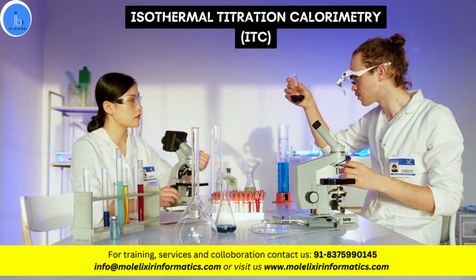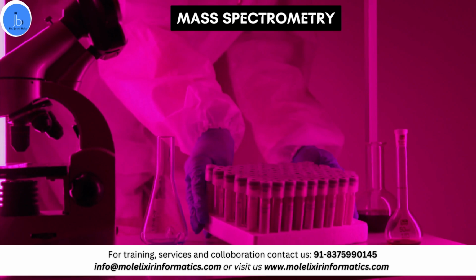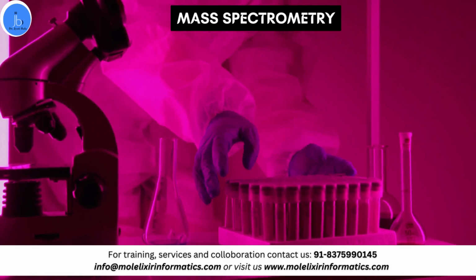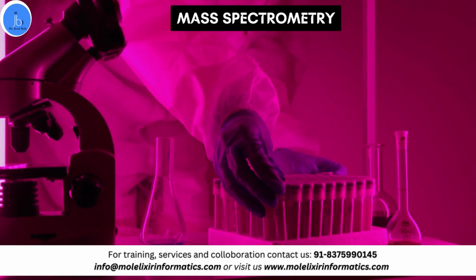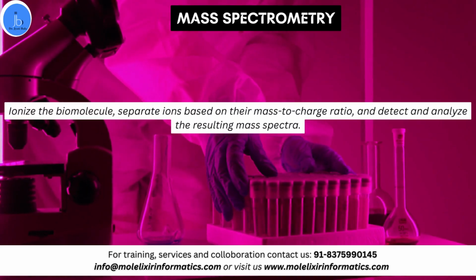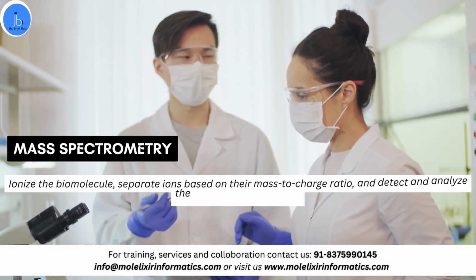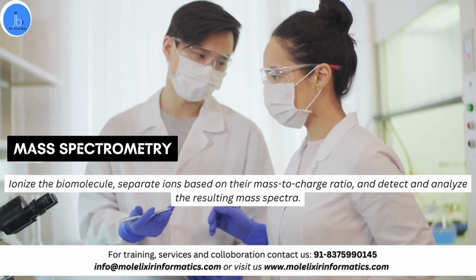The next technique is mass spectrometry, which determines the molecular weight and identifies the post-translational modifications of proteins and other biomolecules. The step usually involves ionizing the biomolecule, separating the ions based on the mass-to-charge ratio, and detecting and analyzing the resulting mass spectra.